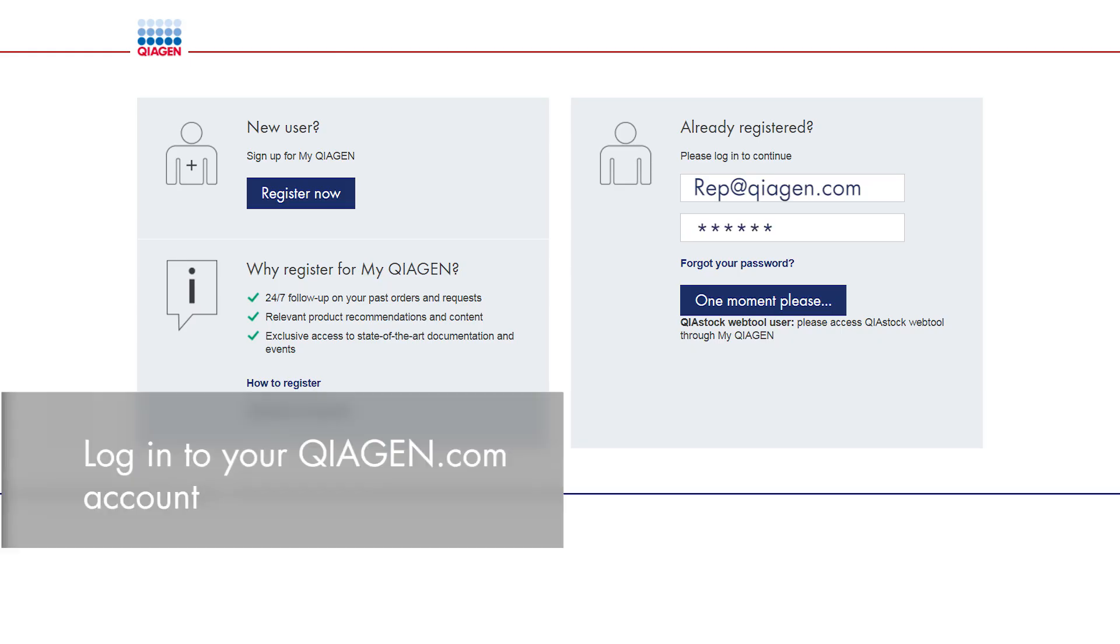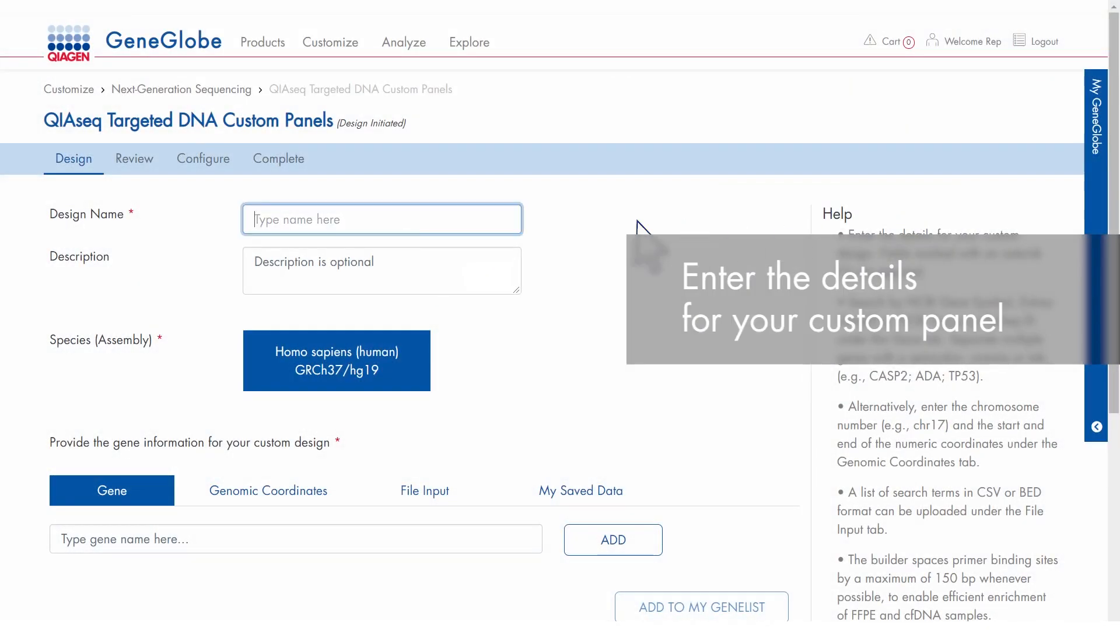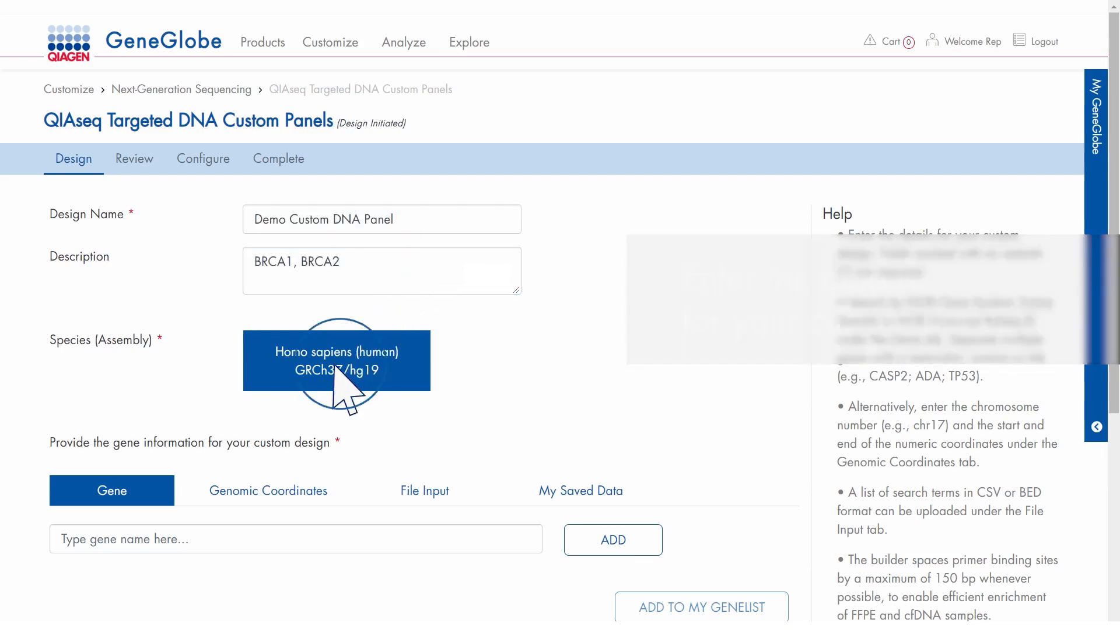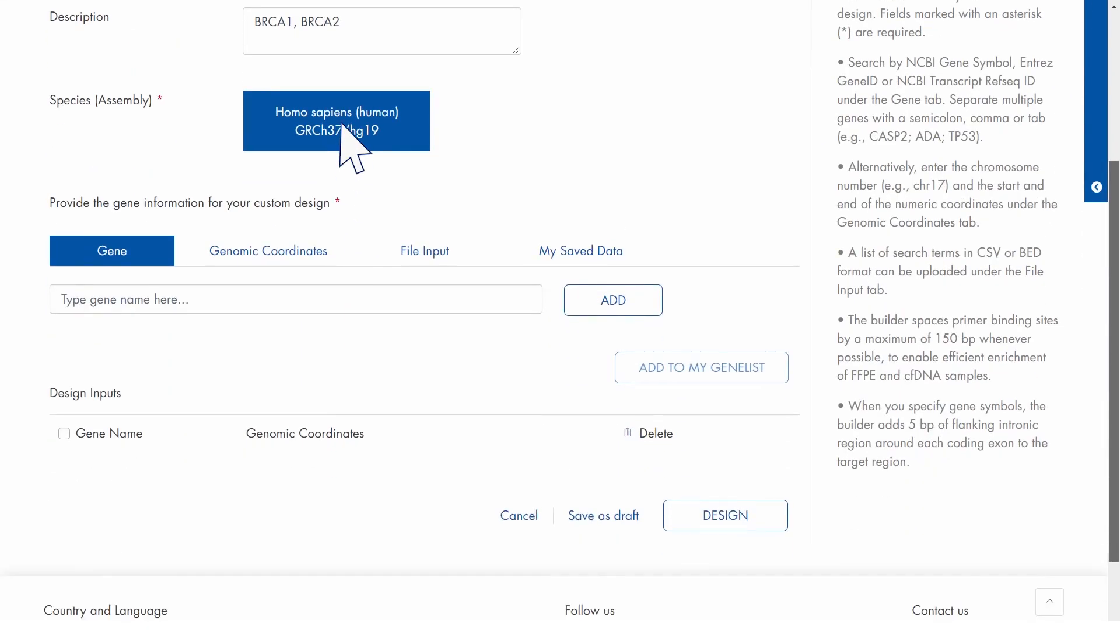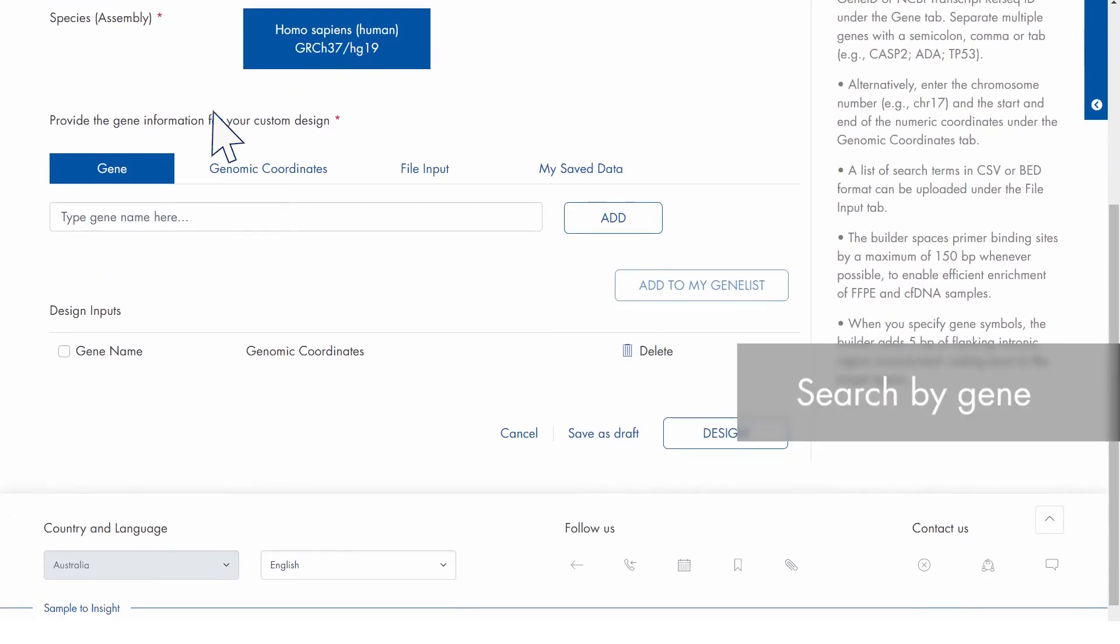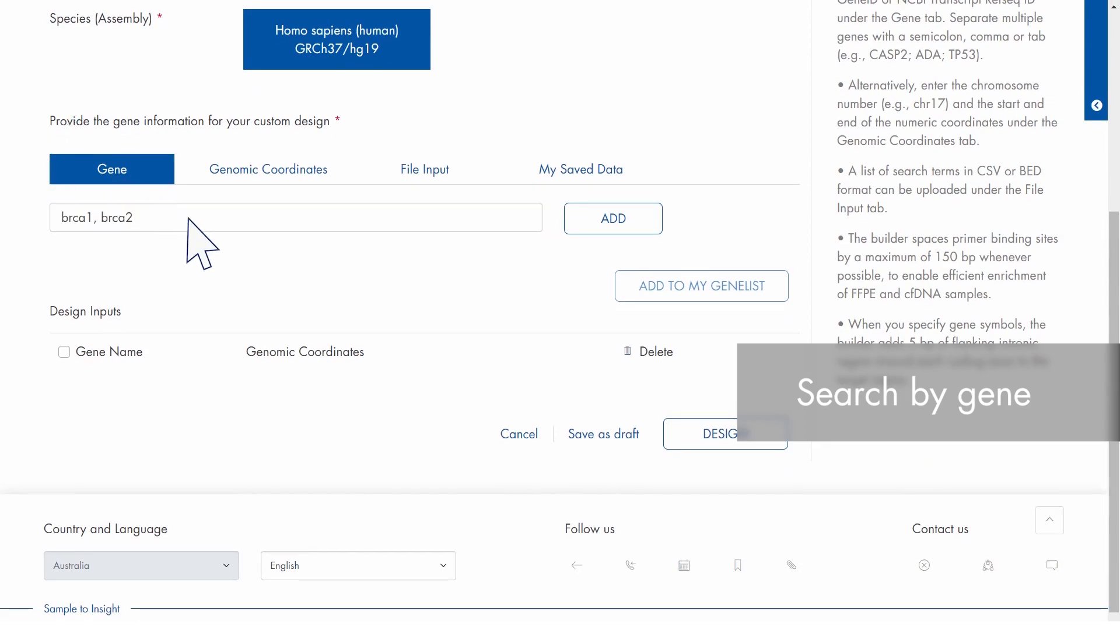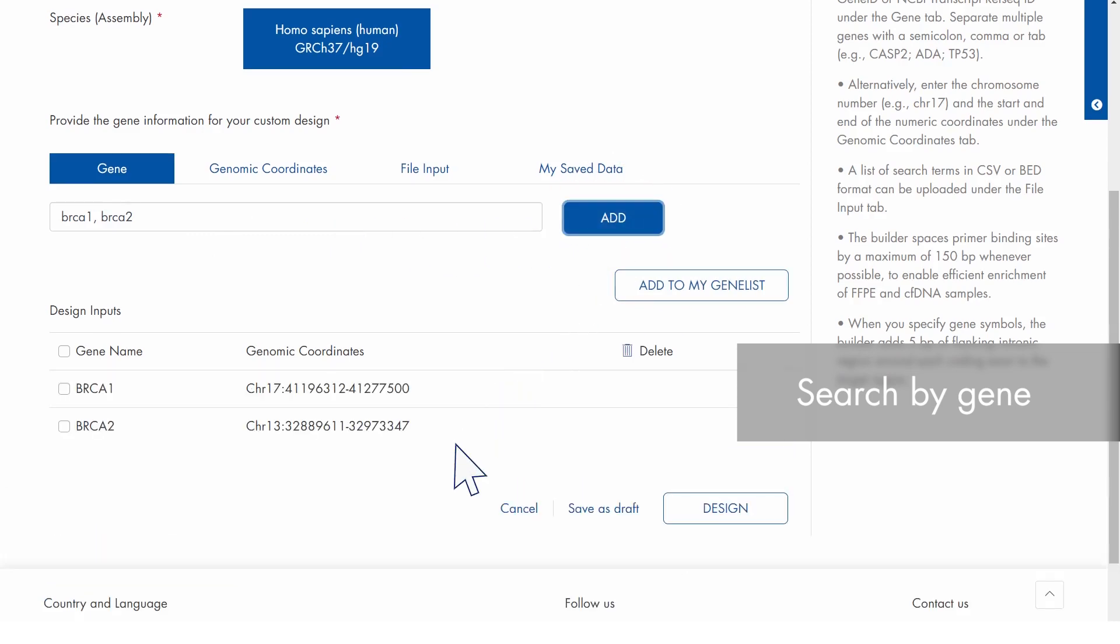Log in to your QIAGEN.com account and enter the details for your custom panel. Use the Gene tab to search by gene symbol, gene ID or RefSeq ID and click Add to include the genes in your panel.